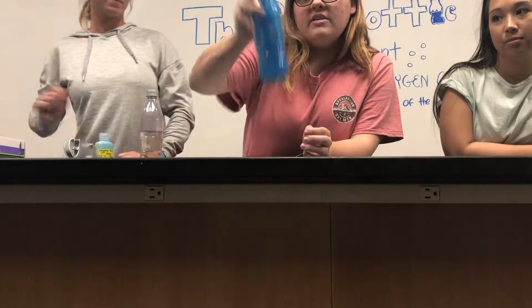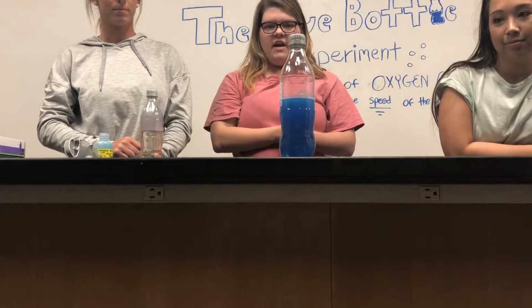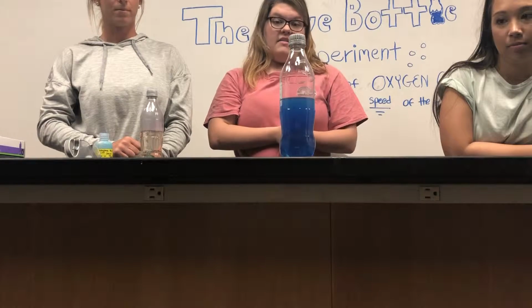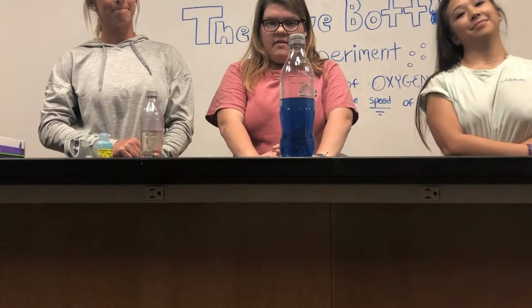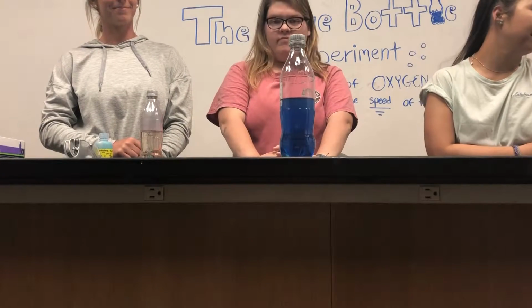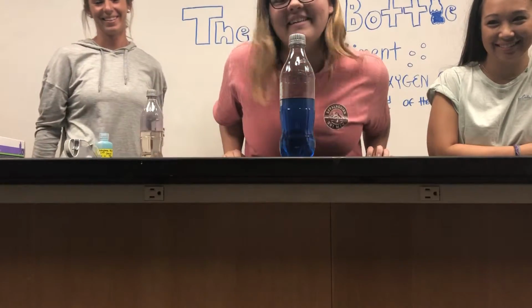We'll show you how it works. Shake it back up, reintroduce the oxygen, concentration of oxygen's in there, and again it starts to fade. Eventually it starts to fade.